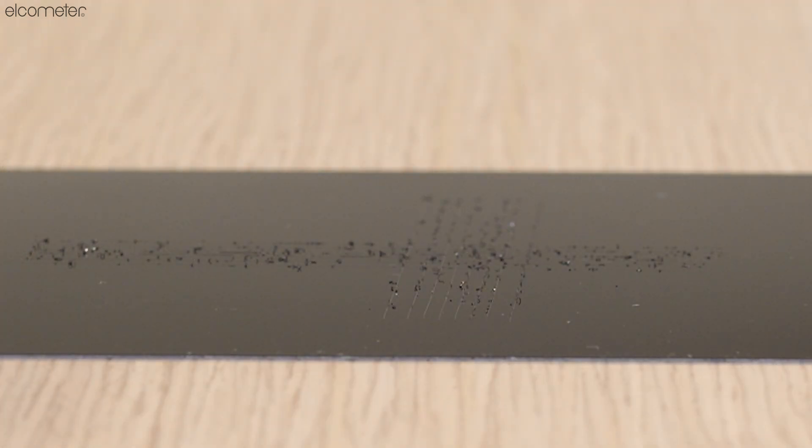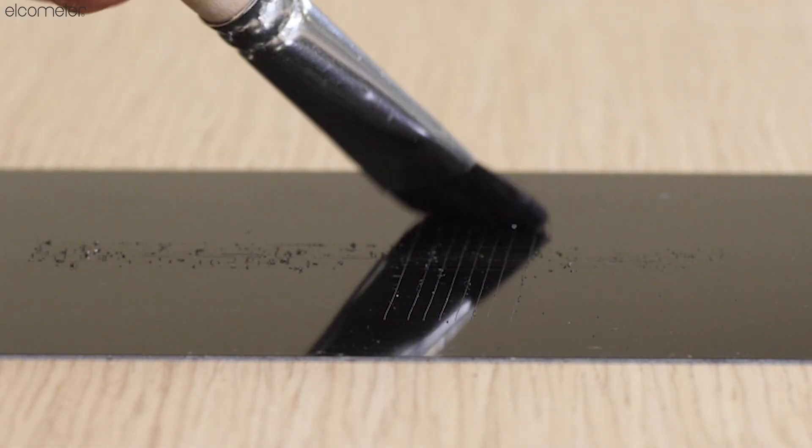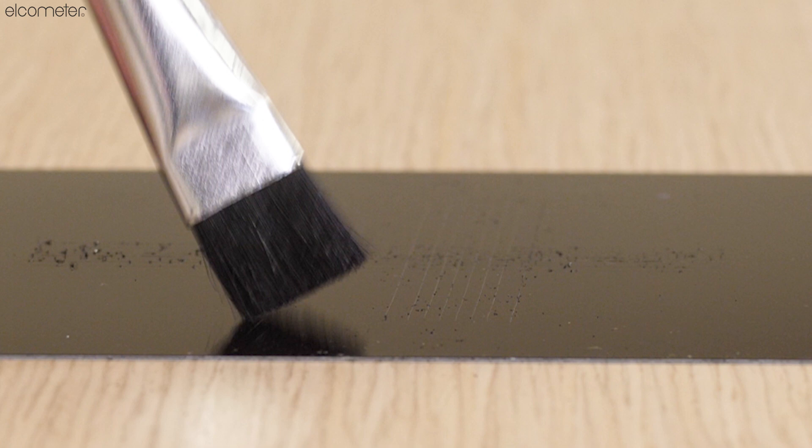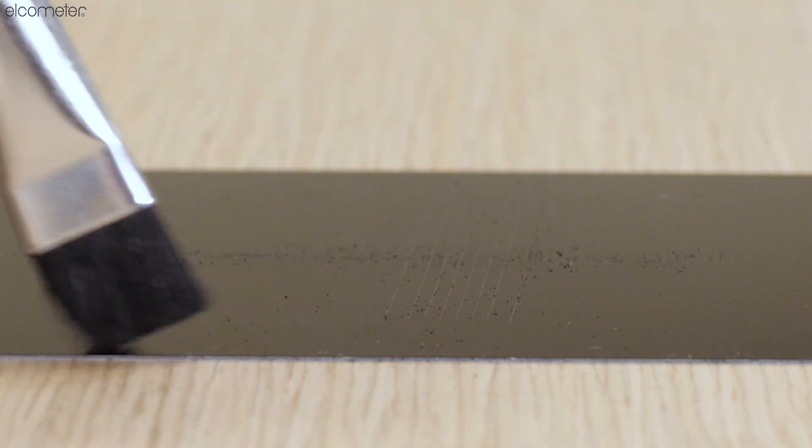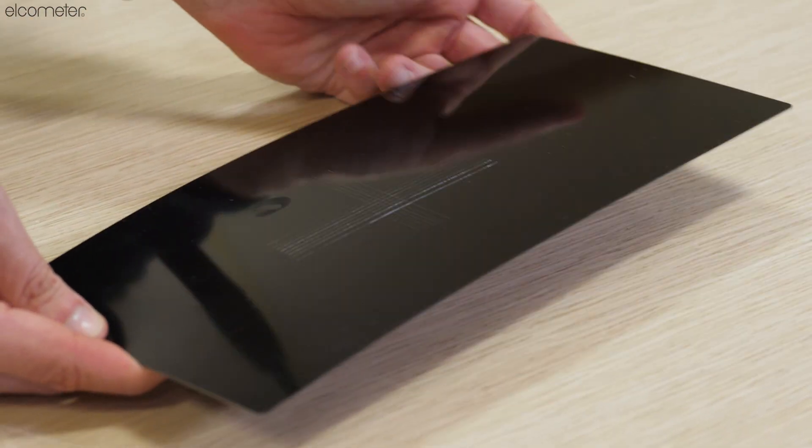Remove any debris which remains on the pattern by brushing the sample lightly and, once clear, inspect the substrate to ensure that cuts have penetrated through the coating.